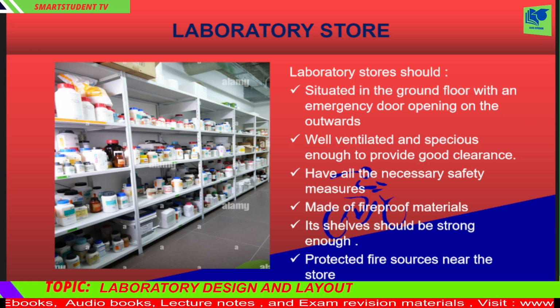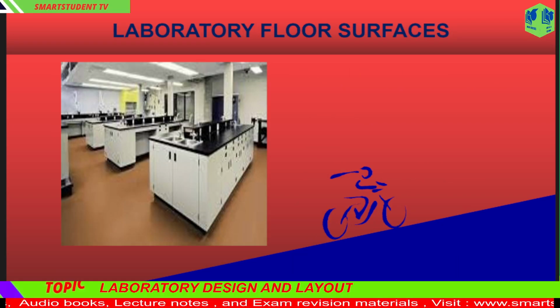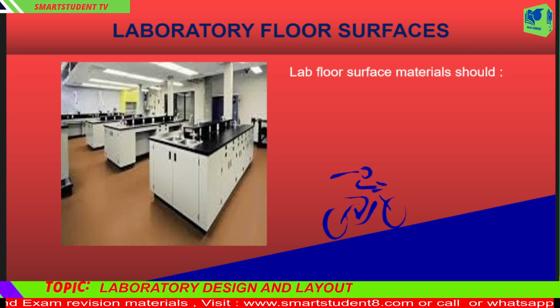Laboratory floor surfaces. Just like the laboratory walls, laboratory floors are also consistently exposed to toxic chemicals and substances that may cause it to deteriorate. It is therefore important to select appropriate materials for construction. Various materials can be used for making the surfaces of the laboratory floors, e.g. wood, concrete, terrazzo, and linoleum, plastic, PVC tiles, etc.